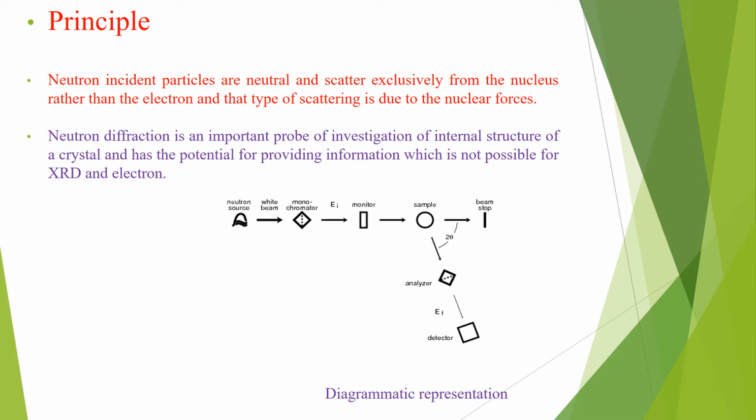Neutron particles have an advantage over electron particles, because neutrons are neutral while electrons are negatively charged. Neutron diffraction is an important probe for investigating the internal structure of a crystal, and it has the potential for providing information which is not possible with XRD and electrons.